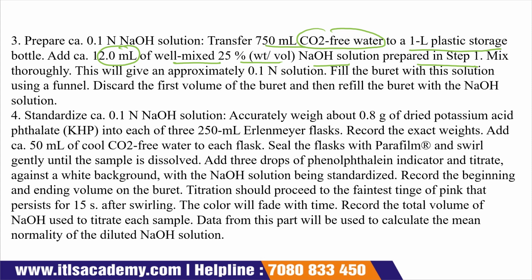Okay, suppose that this is your plastic storage bottle. Here you have to transfer 750 ml of CO2 free water. Now after that you have to add 12.0 or 12 ml of 25% NaOH. Then you have to mix this thoroughly.